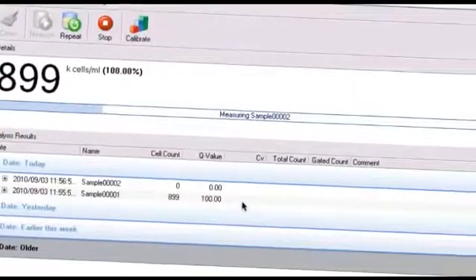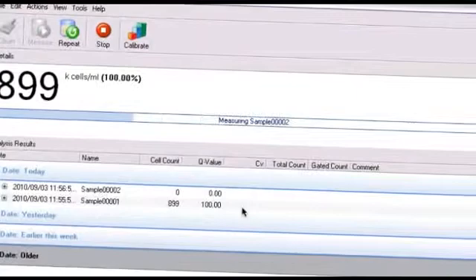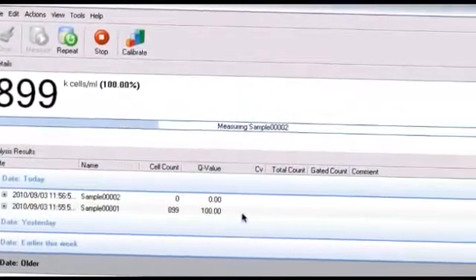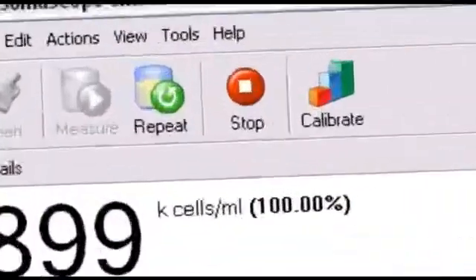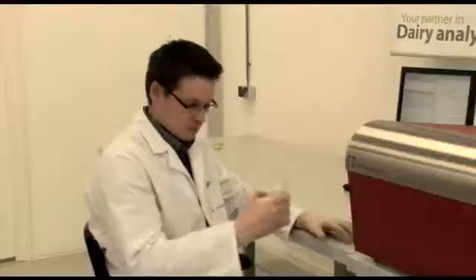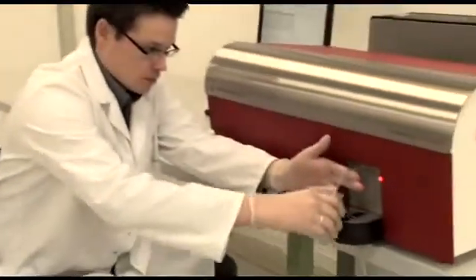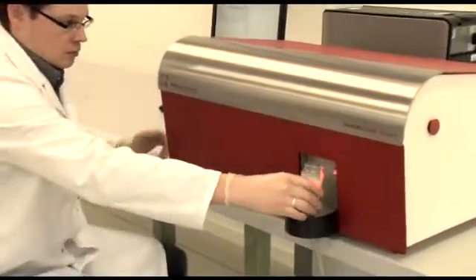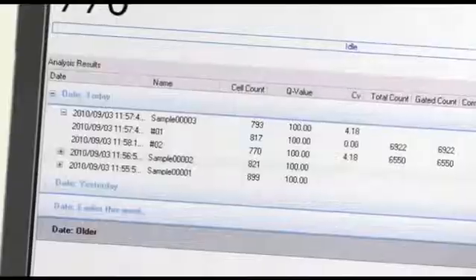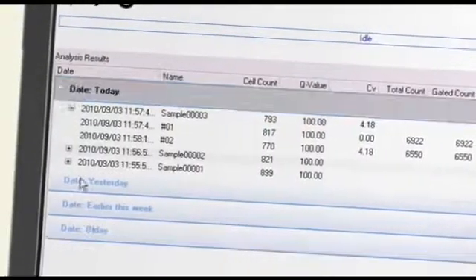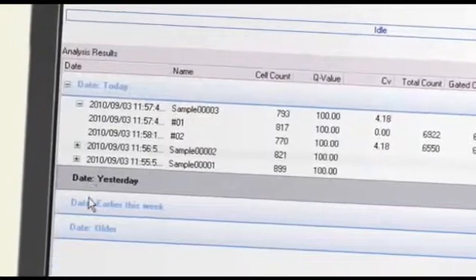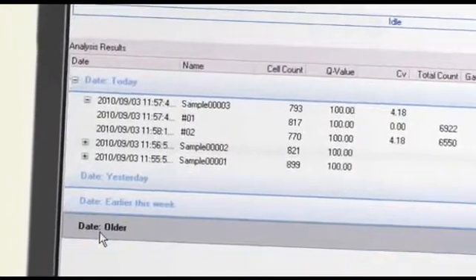Only one measurement will be taken from the presented sample. When it is required to measure more replicates from the same sample, the repeat button needs to be selected. Otherwise, the sample needs to be removed and a new sample can be presented. The results of the analysis are stored on a day-to-day database. This makes it easy to track the results at a later stage.